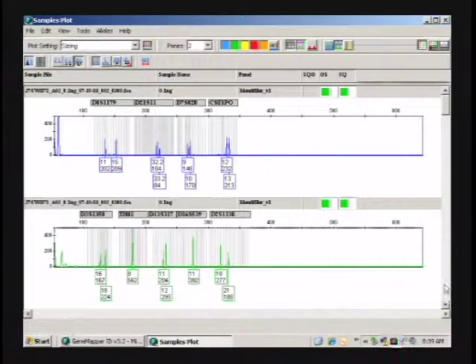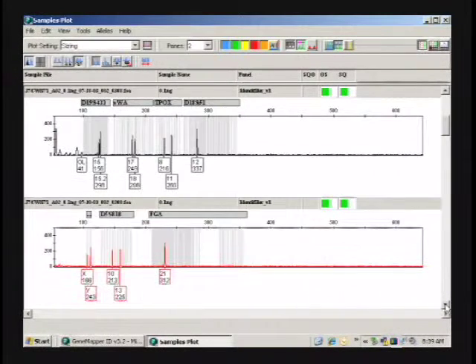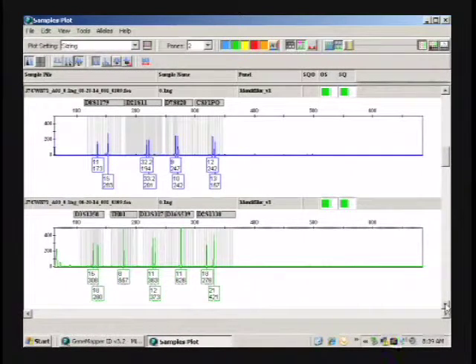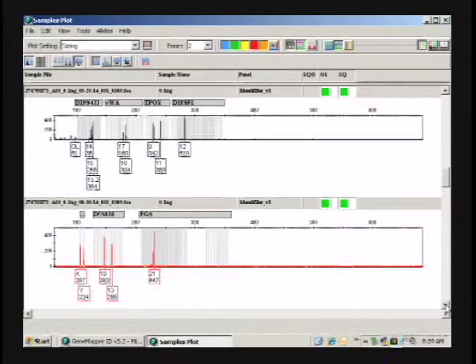So I can just give you an example. This is what some of the original data looks like. The peak heights aren't exactly low, but this was my approximate 0.1 nanogram per microliter. Not that you'd actually want to MinElute this. Most labs probably won't, because everything here, I believe, is even over 150. And you will see that sometimes you may get some peak height imbalances. Well, that's not too bad. But you do see some peak height imbalance. But I did not actually lose any peaks.